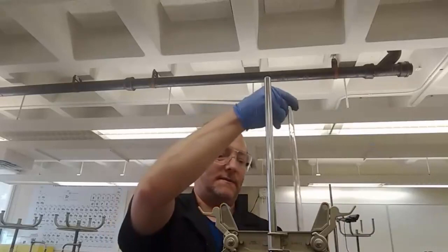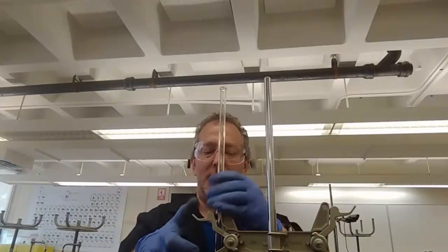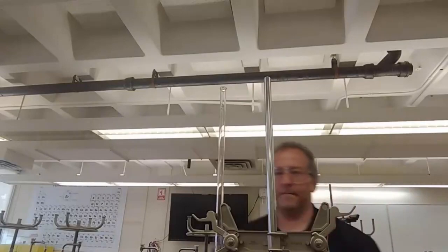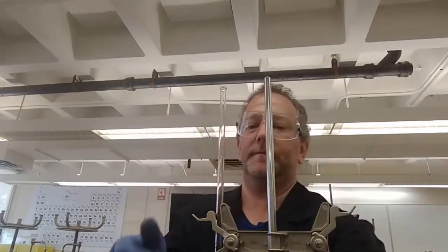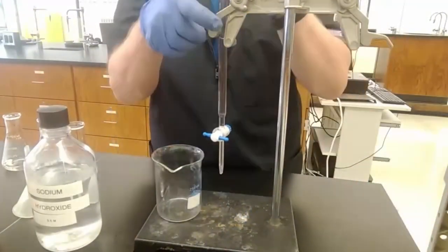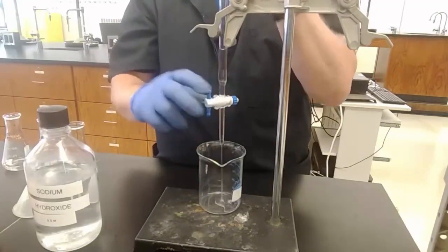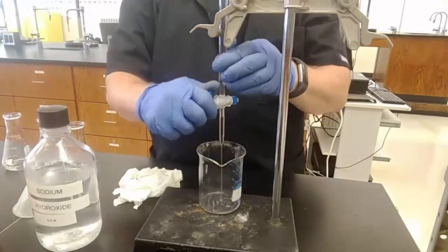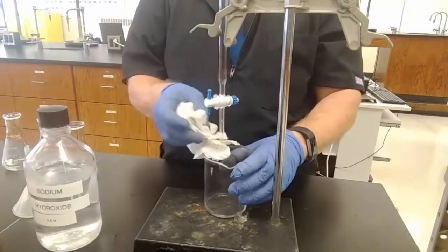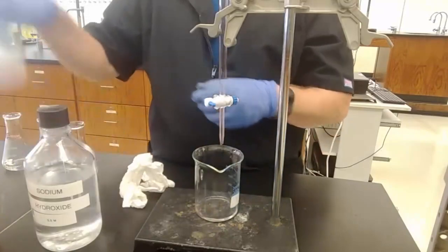Then I'm going to trash this base, now that I'm confident that my glassware is clean. So, just a waste beaker. And I let the base almost all the way drain out. Yeah, I might as well let it drain all the way out. Why not? Okay.